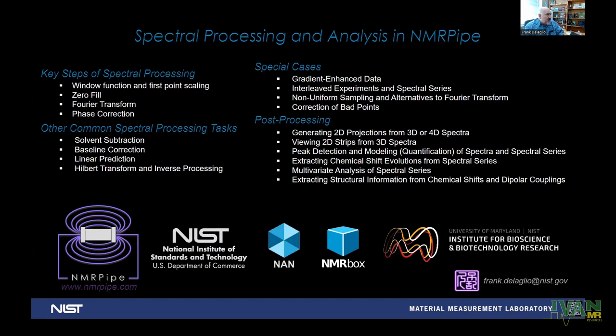This slide gives us a list of the typical tasks in processing and analyzing NMR data, and all of these facilities are available within NMRPipe. And we will see examples of all of these things today and at the next Ivan discussion, which is devoted to analysis.